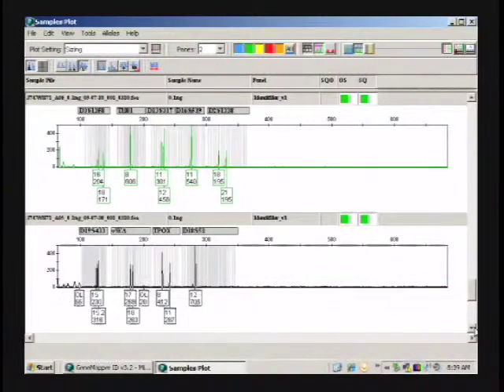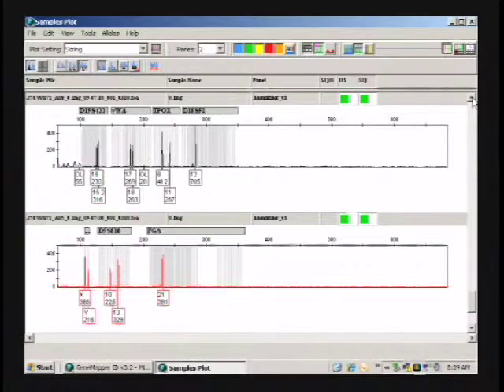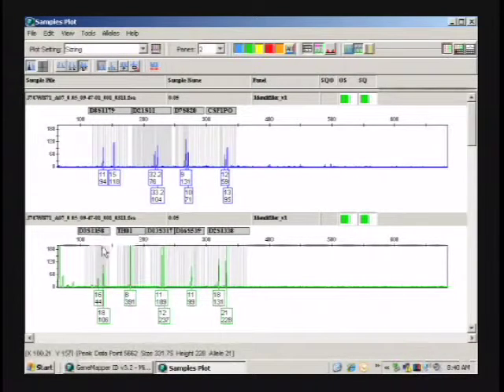So this is what the 0.1 nanograms look like originally. We're looking at peak heights on heterozygotes about the 200 range, some as high as 400, and maybe the homozygotes between 5 and 700. At 0.05, let me grab some of those so you can get an idea. Okay, at 0.05, you see they go a bit lower.